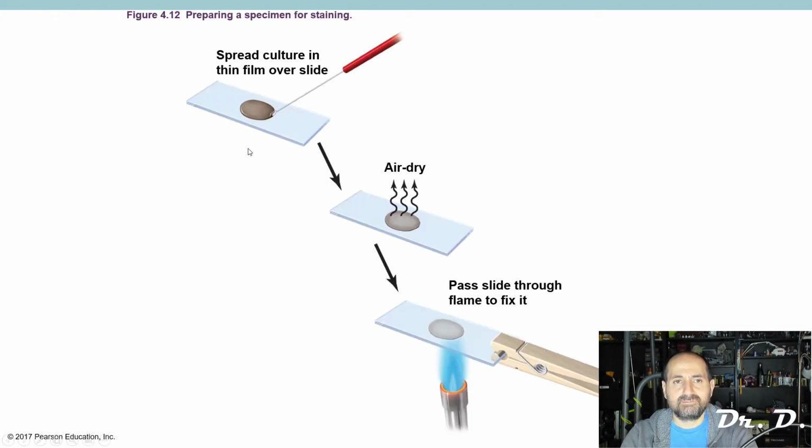So how do we typically prepare specimens in the microbiology lab? It's called a smear technique. You take bacterium from an inoculum on a loop, spread the bacteria in a drop of water, and then allow this suspension of bacteria to air dry.